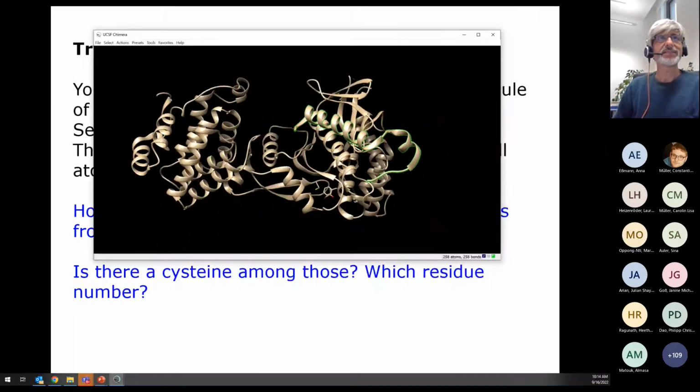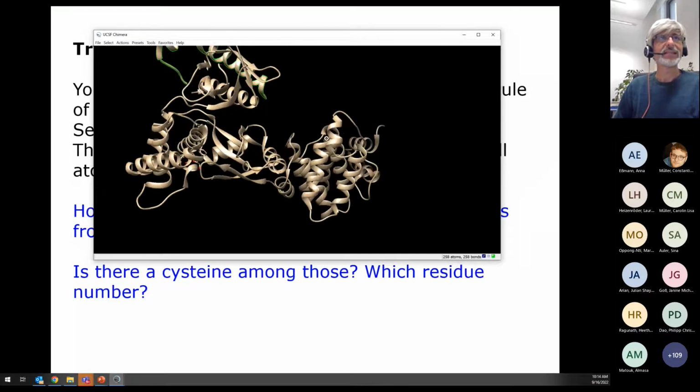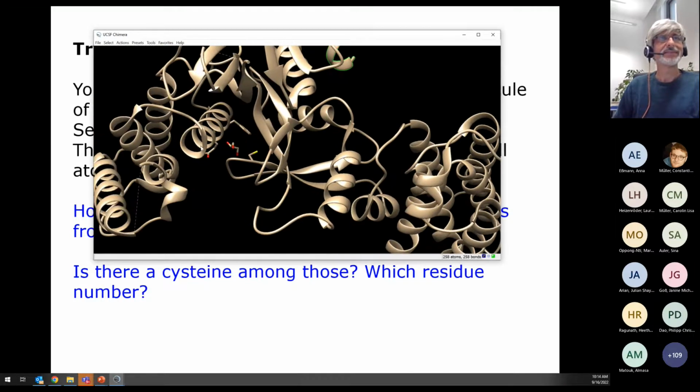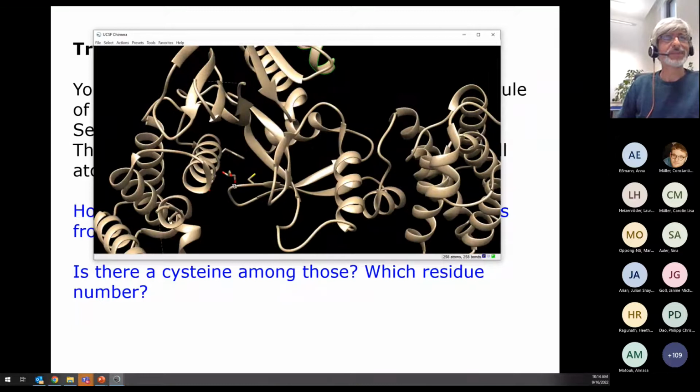So remember that in this molecule, there is a little molecule over there that is represented with the red. Yes, with the red. I don't see the protein now. Yes, now I see. Thank you. So that would be the glycerol molecule.